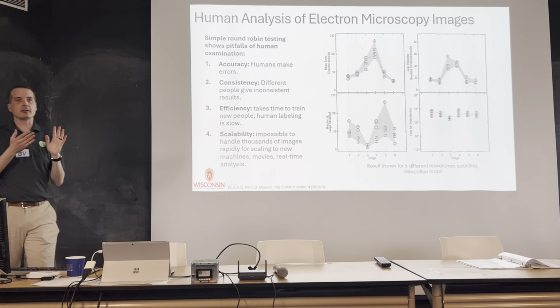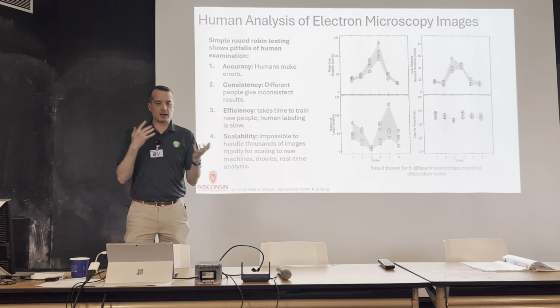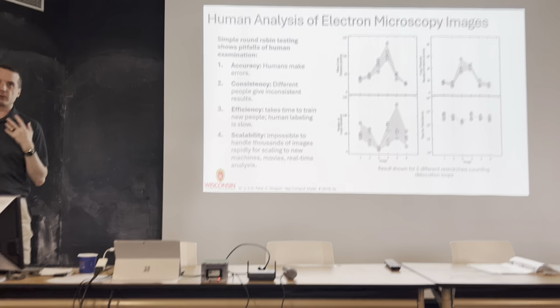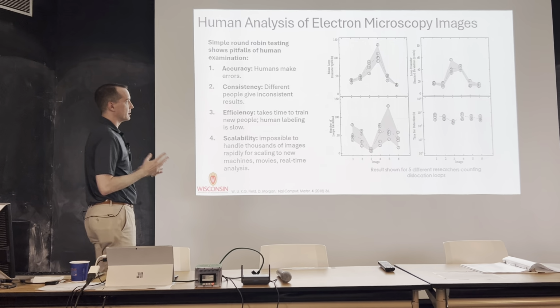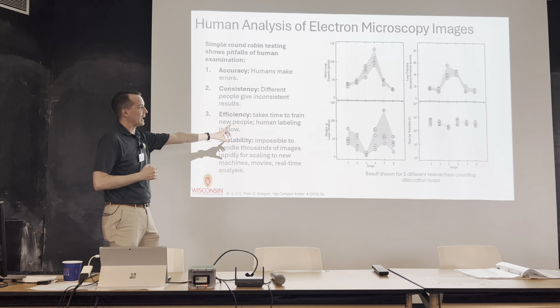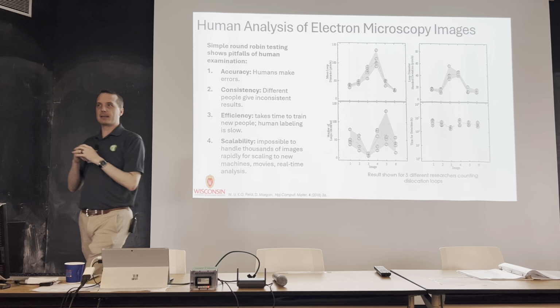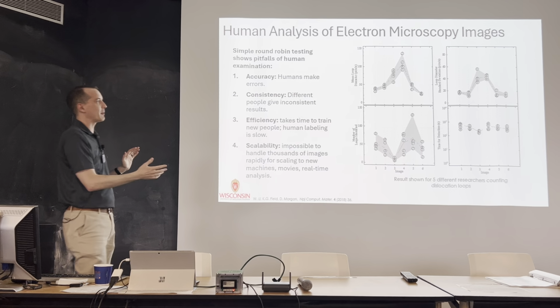the models out there, and there's been this long-standing mentality that you can never do better than a microscopist, and that the trained expert is always going to be better than anything else that you can do. And so they did a round-robin experiment. They sent out a variety of images, the same images, to a bunch of different researchers and asked them to quantitate the images by hand, right? Let's walk through that workflow, let's go through that process.